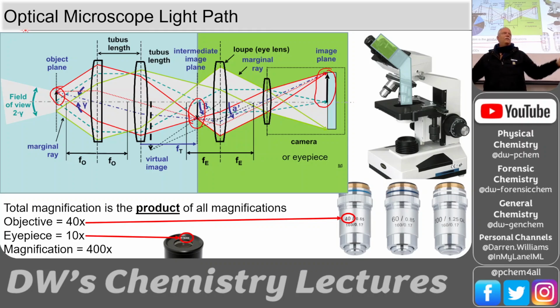How many of you, I know y'all are forensic chemistry majors, have had biology or have used microscopes? So it looks like, yeah. How much detail did they go into in terms of selecting objectives and all of that? What'd they say? Just switch it, go to 40x or whatever, yeah, okay. Did y'all do oil immersion? You did, okay, that's good. Did you use a cover slip or not? With, yeah, it makes it more stable. You disperse the sample under the cover slip, then you put a drop of oil, and then you bring the nose of the objective in.